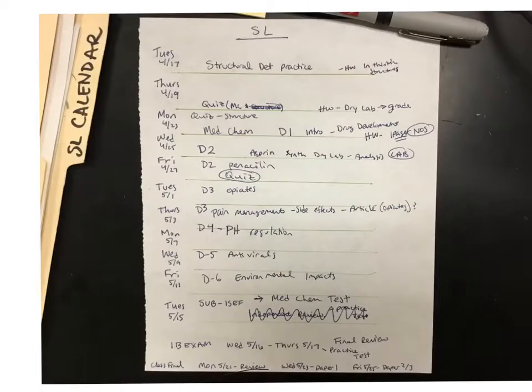But again, with your mass spectrum, get that parent ion so you can get your molecular formula, but then come back later if you need to analyze it. Recognize how you can, and you might be asked some specific questions about a mass spectrum, but as far as an actual structural determination, I'd only come back to it if I had to, if it were me.